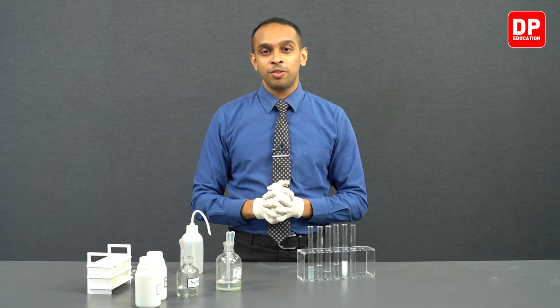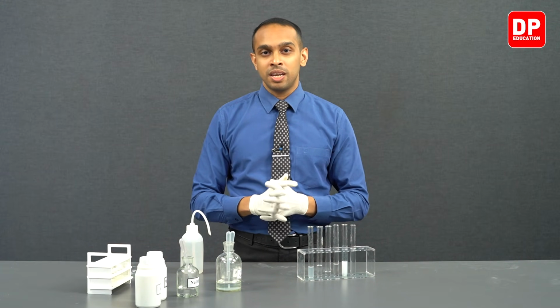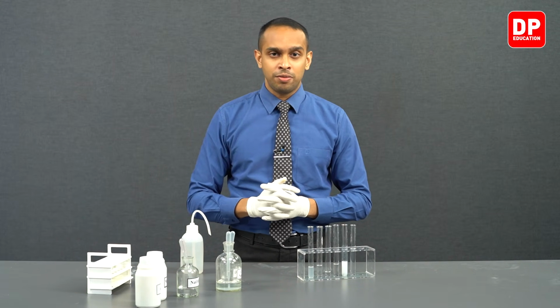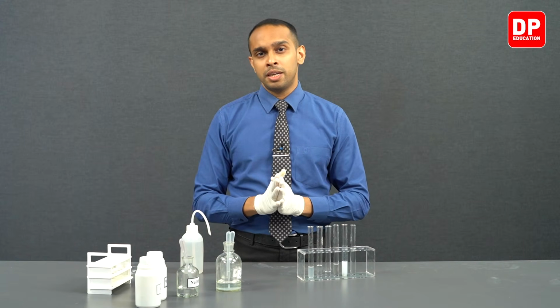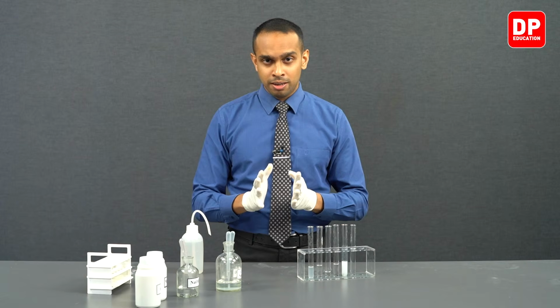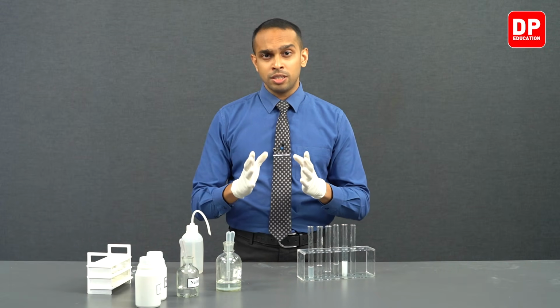Now students, we observed two main experiments in this particular part of our experiment. We saw hydroxide ions can be identified with the use of aluminium 3+ ions or zinc 2+ ions. Both of them will produce a white color metal hydroxide that is insoluble in water. Upon the addition of HCl, these hydroxides will dissolve. However, upon the addition of excess sodium hydroxide, we saw they will also dissolve to form a clear solution.